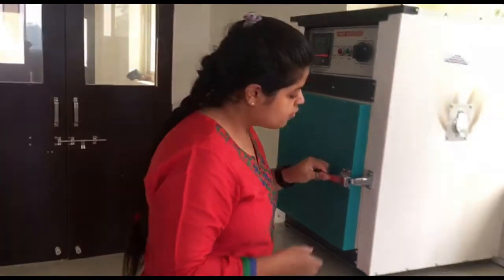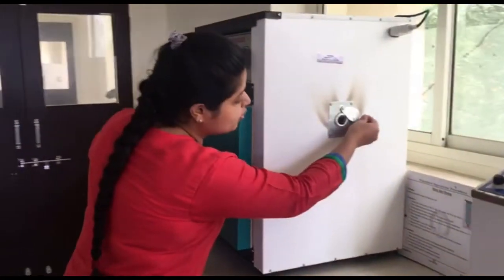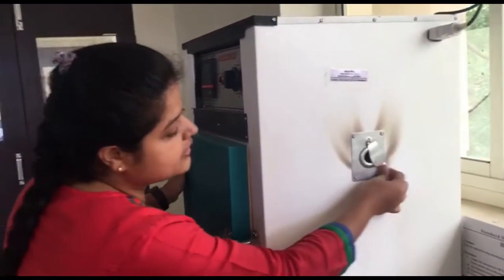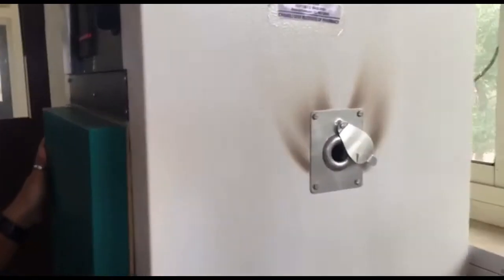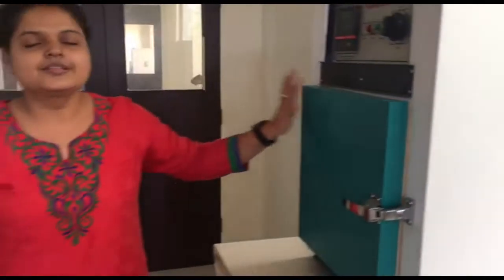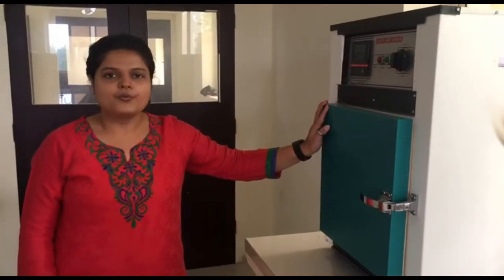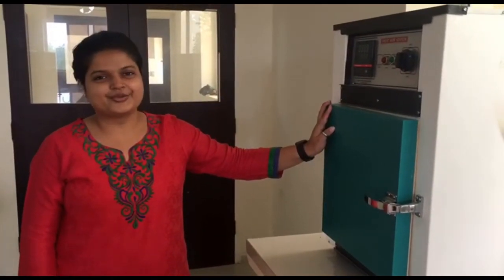Also when you look at both the right and left side of the instrument there are two holes — these are for the exhale of the vapours. So this is the construction of hot air oven. Hope this will help you. Thank you.